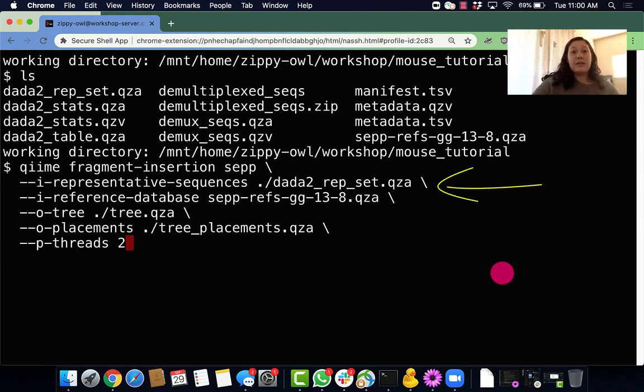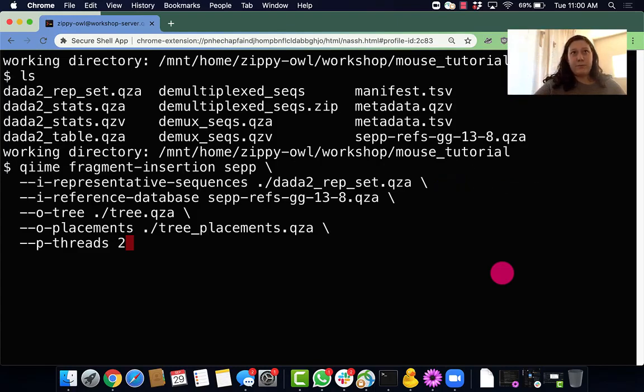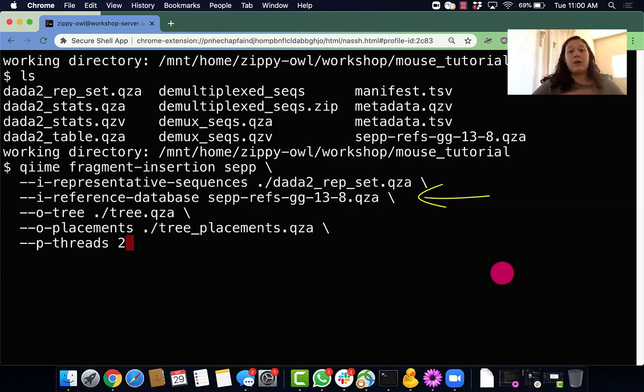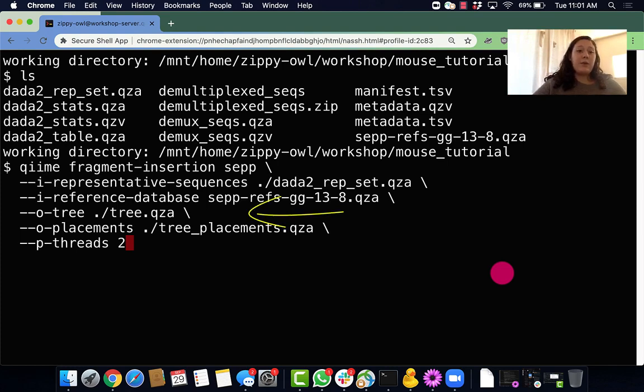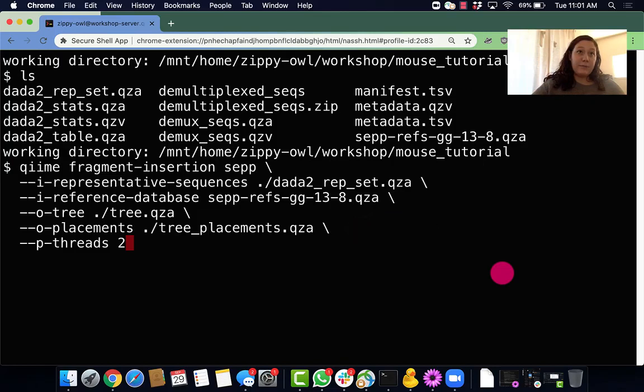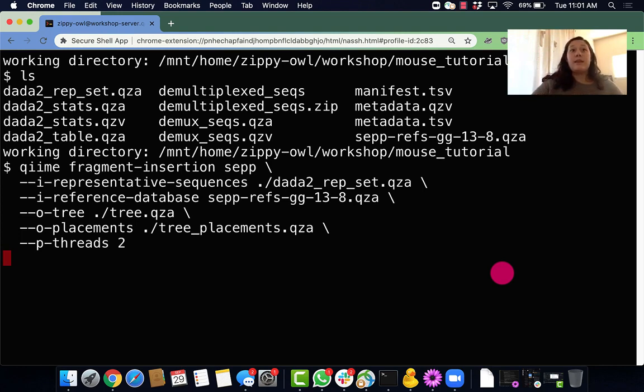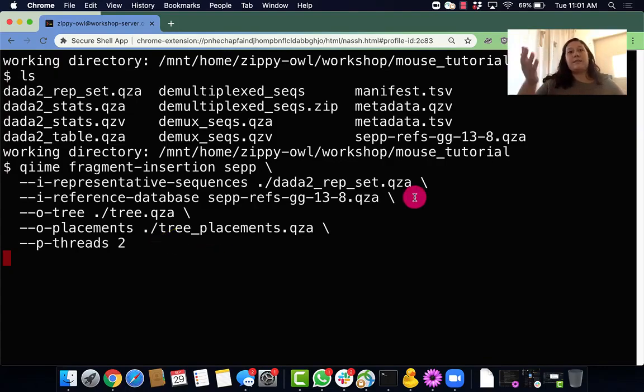These are our sequences that we denoised and now we're using to create our phylogenetic tree. Our reference database is our reference tree that we're using to insert our sequences into. It's also some alignment data and metadata that's relevant to the set command that allows it to perform the insertion. This is one of our outputs which will output the tree that we need. And this is an output of the placements of the sequences in that tree. It's something to note that QIIME doesn't actually use that currently. And then lastly, our parameter threads which allows us to run on multiple CPUs which will make this step faster.